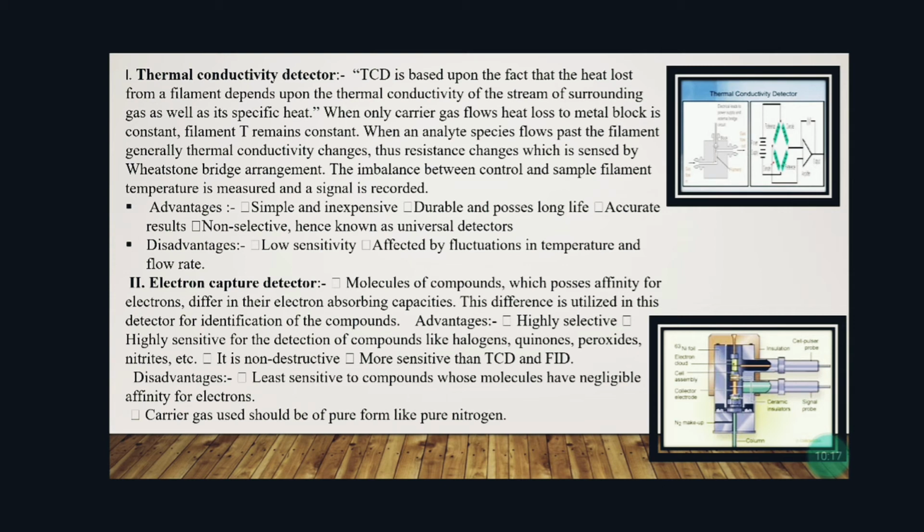Its advantages are simple and inexpensive, durable and possess long life, accurate results, non-selective, hence known as universal detector. And disadvantages are low sensitivity, affected by fluctuation in temperature and flow rate.